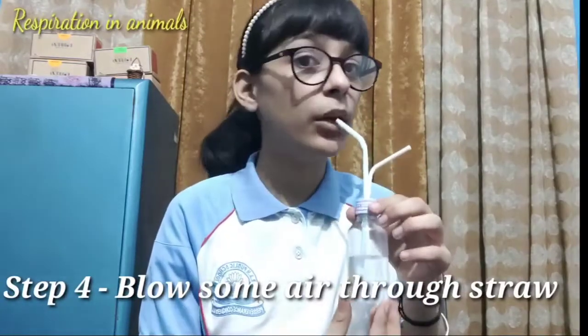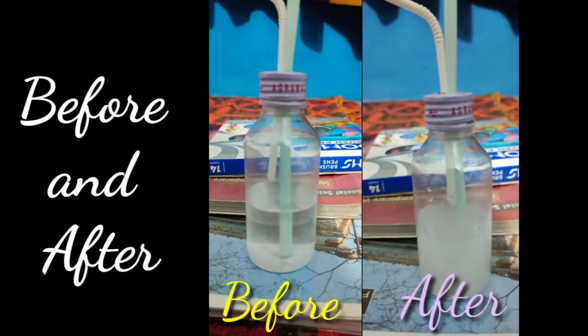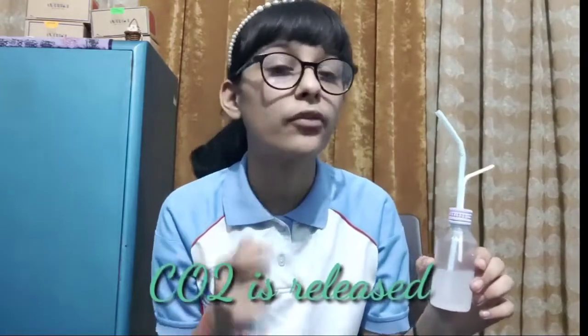After making this proper mechanism, blow some air using this straw. Make sure to keep the water in place. Observe the changes. You have to repeat the steps 30 to 40 times. After doing the steps 20 to 40 times, I have observed that the solution inside the bottle has turned milky. As we have already studied, lime water turns milky only in the presence of CO2. So we can conclude that CO2 is released with exhaled air due to the process of respiration in our cells.